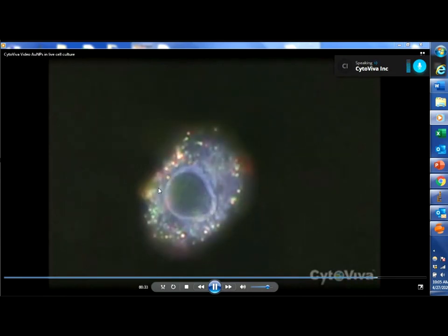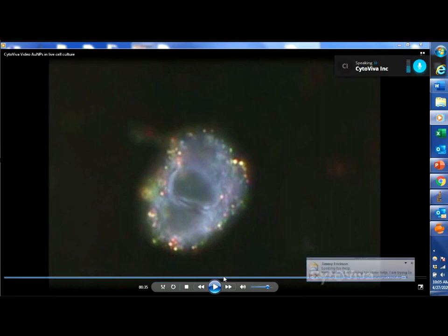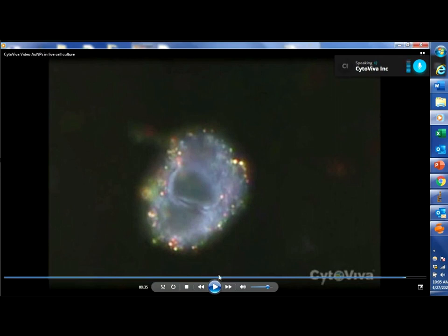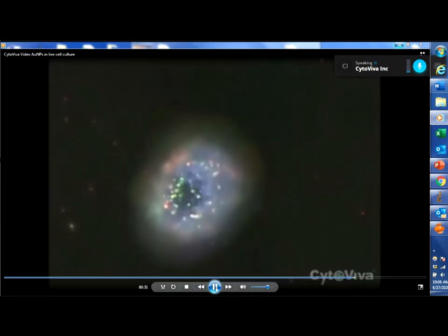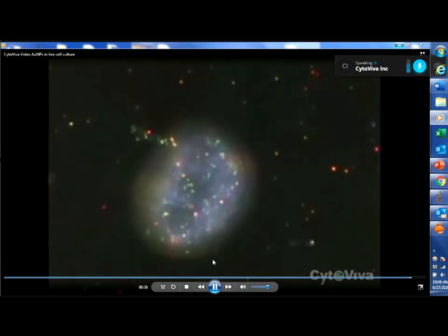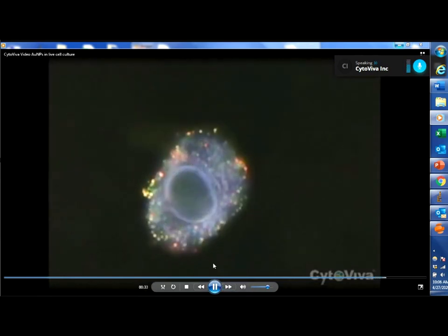Something we get asked continually since the beginning of the release of this technology is: where are these particles? I can section through and see that these particles are obviously at different focal planes, but are they inside the cell? Are they on top of the cell? We can sort of surmise that some are within the cell — certainly the ones that are moving around, kind of trapped, we can guess they are inside the cell — but we're not really sure. So we took it upon ourselves to see if we could answer this question.